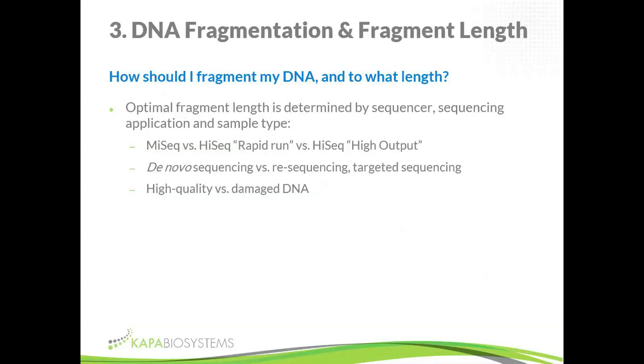So that's fragment length. Fragmentation methods, we've spoken about that. Essentially, we have mechanical shearing, which is the Covaris. There are other things like bioruptors and nebulizers, but the Covaris is by far the most widely used mechanical shearing methodology. It's very random. It's a bit of a pain, so it requires expensive equipment and expensive consumables. It's time-consuming, but it is the most random fragmentation method out there.